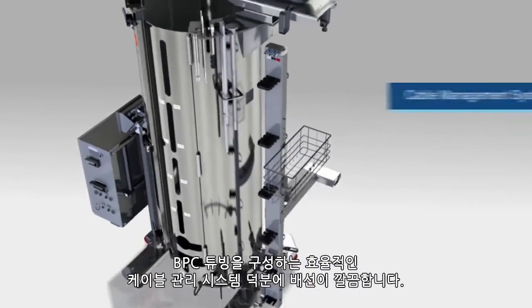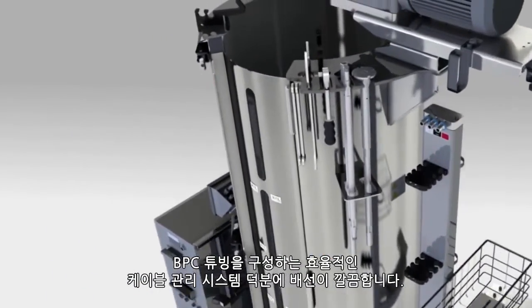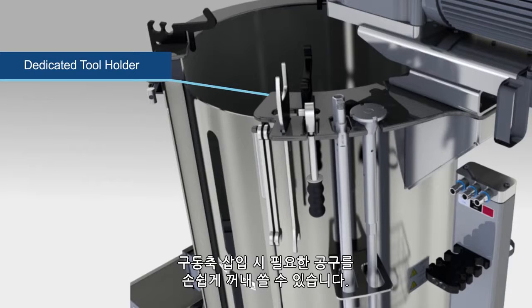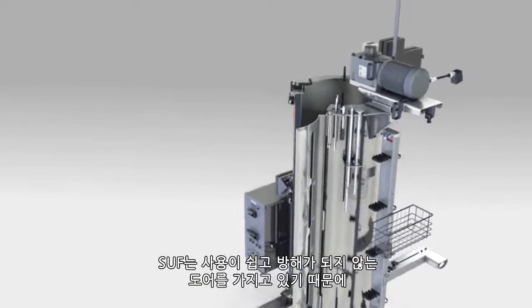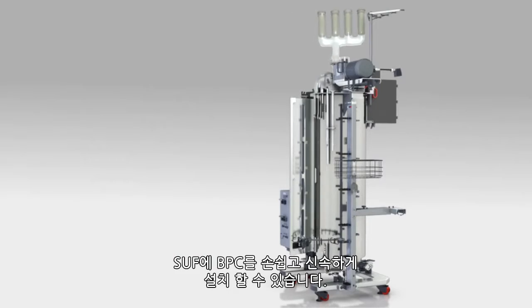An efficient cable management system organizes BPC tubing to help reduce clutter. A dedicated tool holder is positioned next to the motor mount to keep required tools accessible for driveshaft insertion. Loading of the BPC into the SUF is simple and quick, because the SUF was designed with an easy-to-use, unobstructed door.